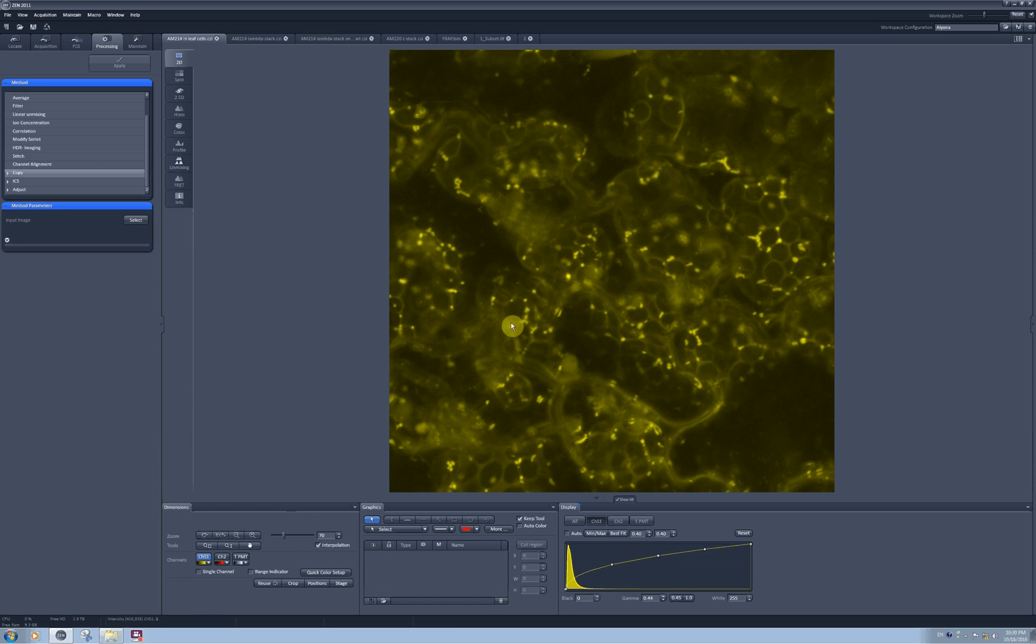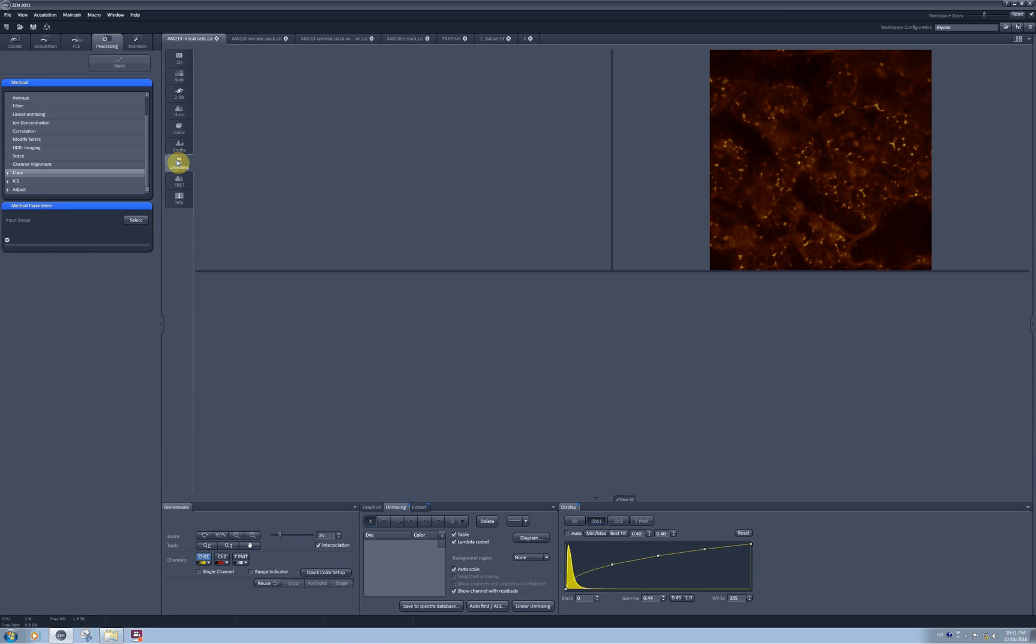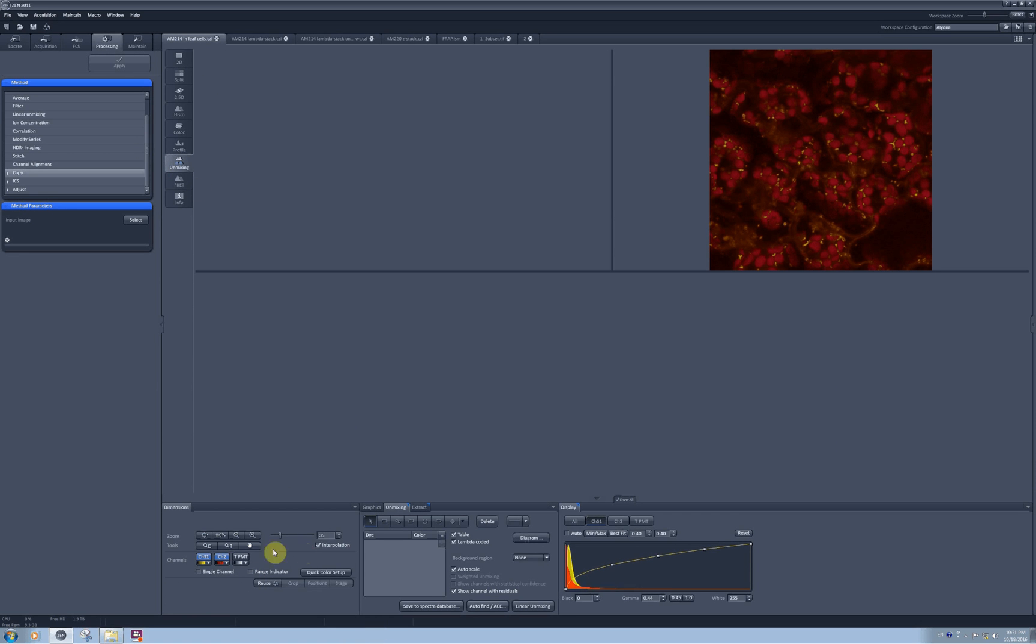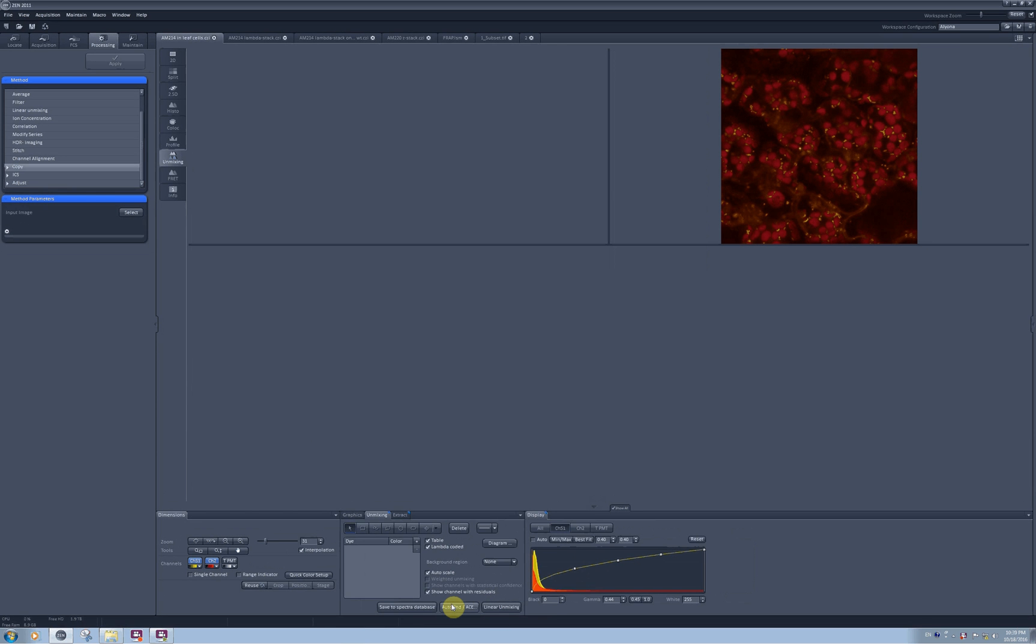To be able to remove this signal which I definitely know shouldn't be there, I can perform linear unmixing. I will proceed to the tab linear unmixing and the easiest option is to use the automatic component extraction to ask the software to determine the spectra to be used for unmixing.